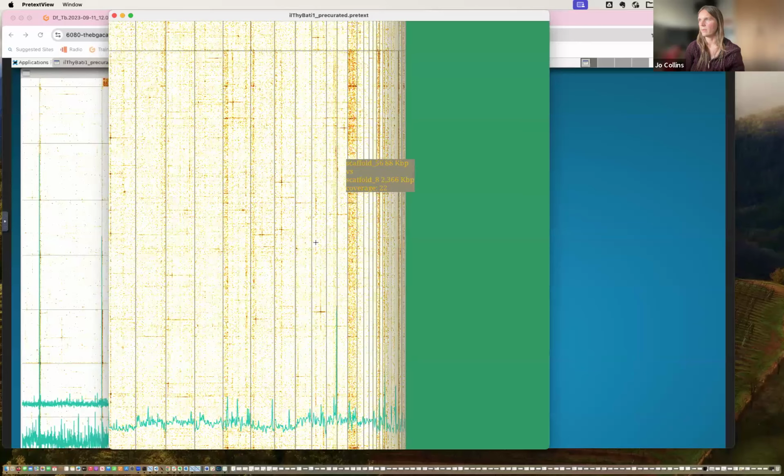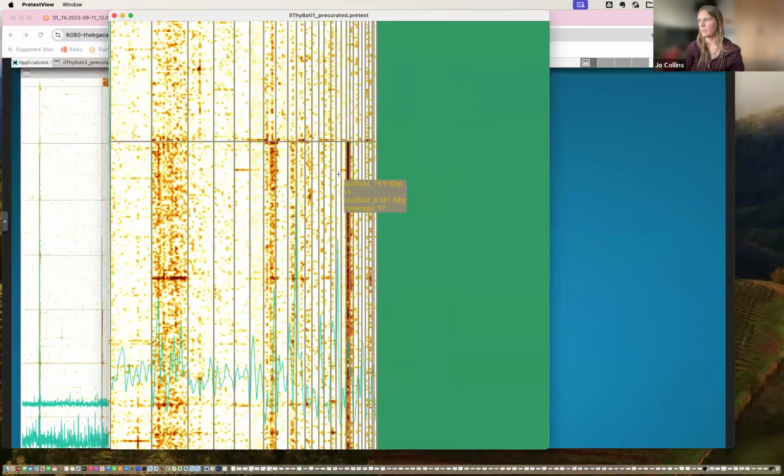I think there's a tiny piece there actually. I've got a piece that goes in there. So that looks like it goes on the very end, looking at its contact. We've got a couple of pieces there actually, one we can't tell.